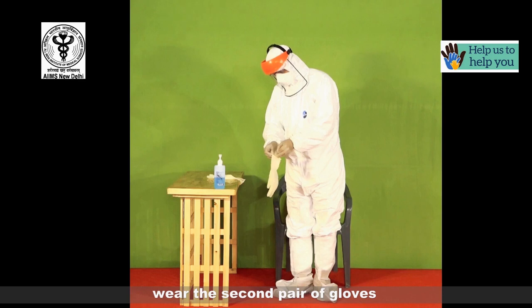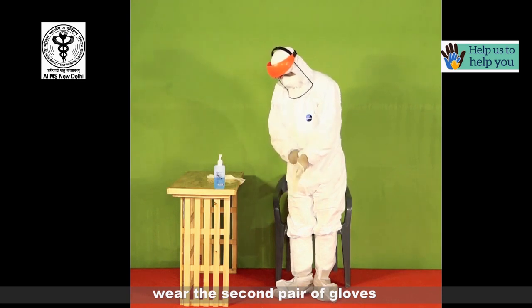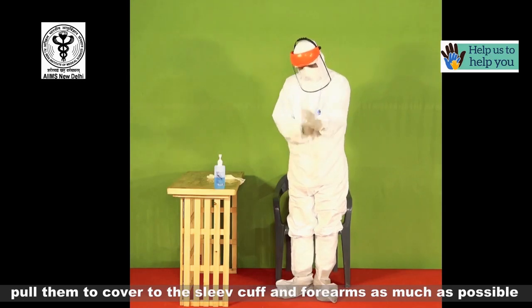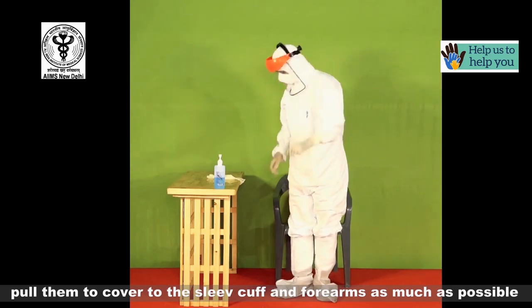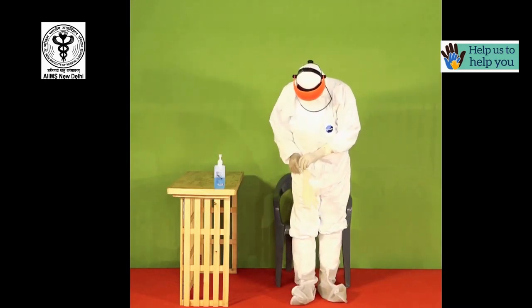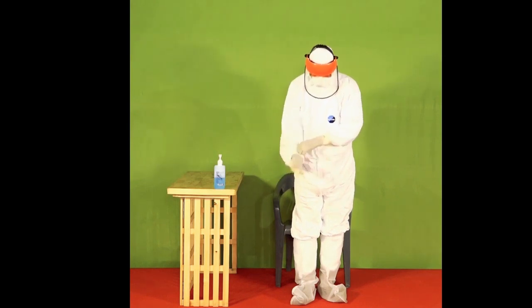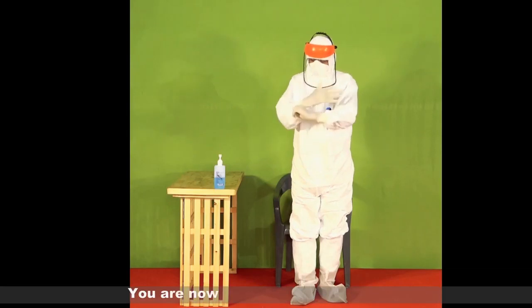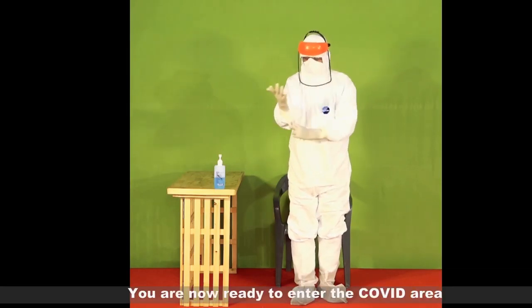Now wear the second pair of gloves. Pull them to cover the sleeve cuff and forearms as much as possible. You are now ready to enter the COVID area.